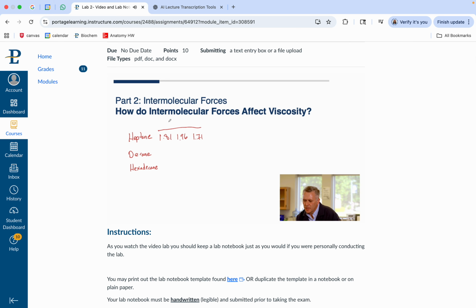And once again, these are the individual measurements that we took. And then for decane, it was slower, but similar in terms of the rates. The times weren't exactly the same, but again, we can average these out to get a better rate. So these are individual values, in seconds. And then hexadecane was the slowest of all, 9.63, 11.54, so there's some variability there for sure, and then 10.49. And again, these are all the individual times.